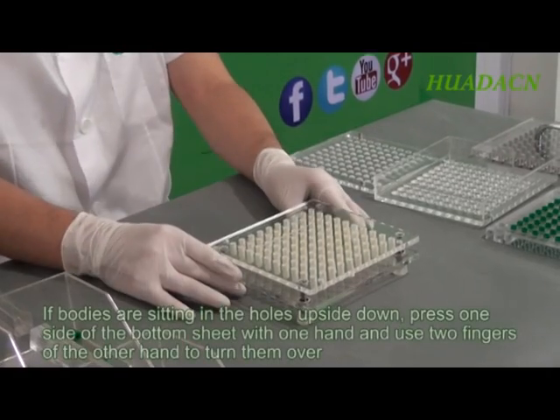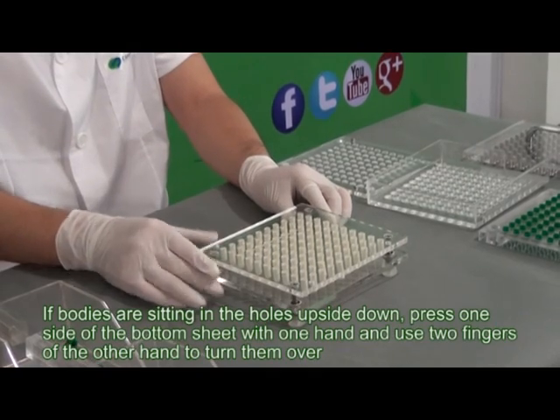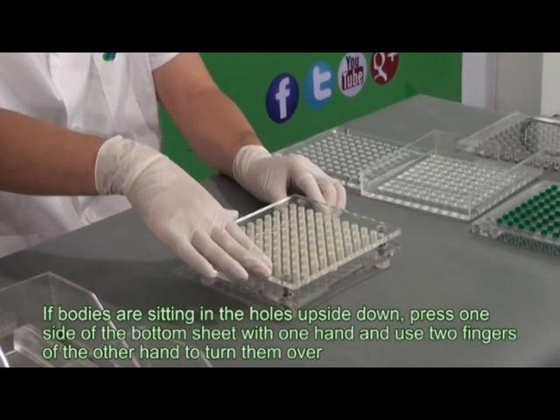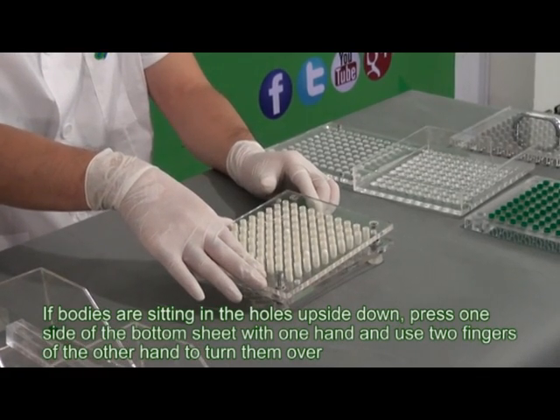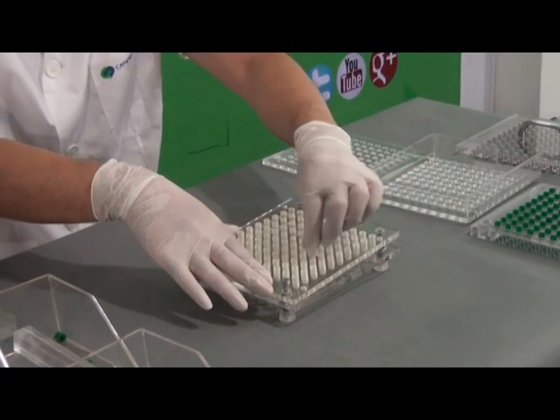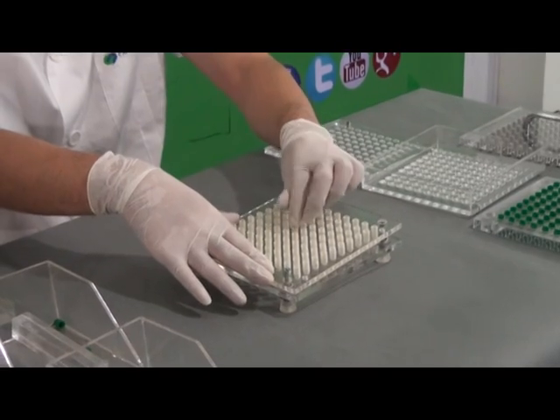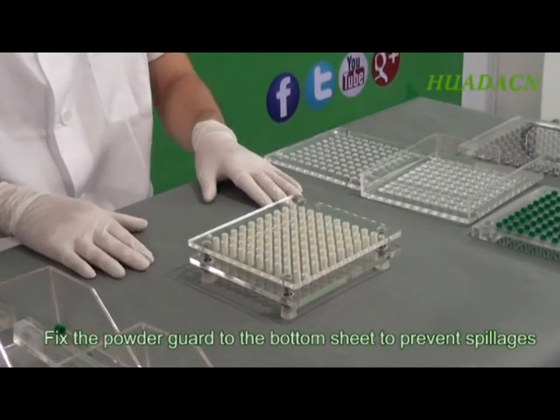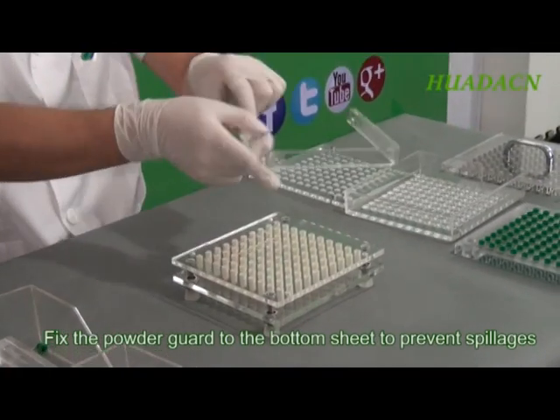If bodies are sitting in the holes upside down, press one side of the bottom sheet with one hand and use two fingers of the other hand to turn them over. Fix the powder guard to the bottom sheet to prevent spillages.